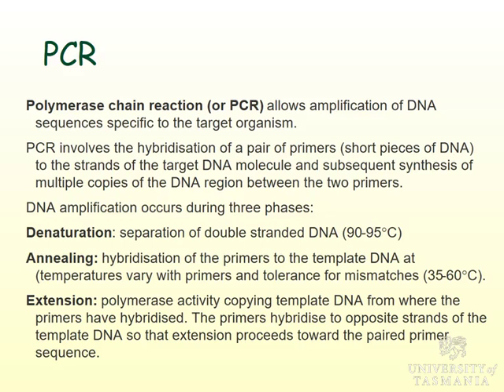We'll copy along and make a copy. So if you want to copy nucleic acid, you have what they call a primer, a short piece of nucleic acid that will recognise this bit, and an enzyme. And the enzyme copies it along. So he was thinking, well, if I do that, I'll just make one copy.